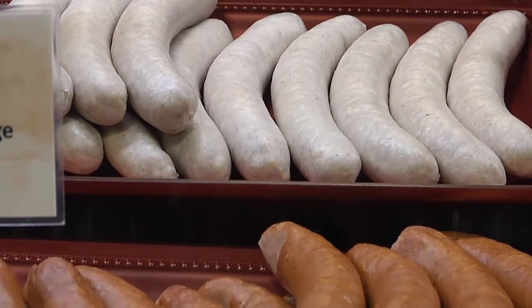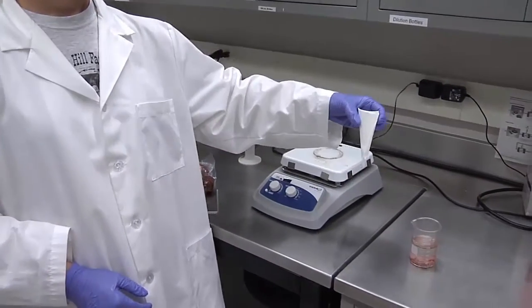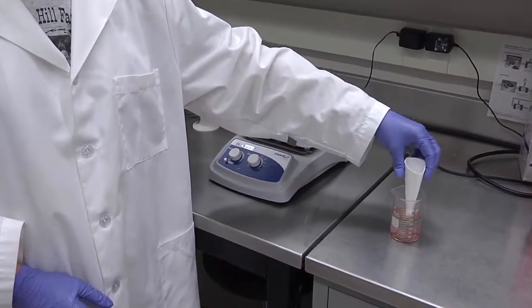In this video, we will discuss a rapid and cost-effective method to measure salt content of your finished products.